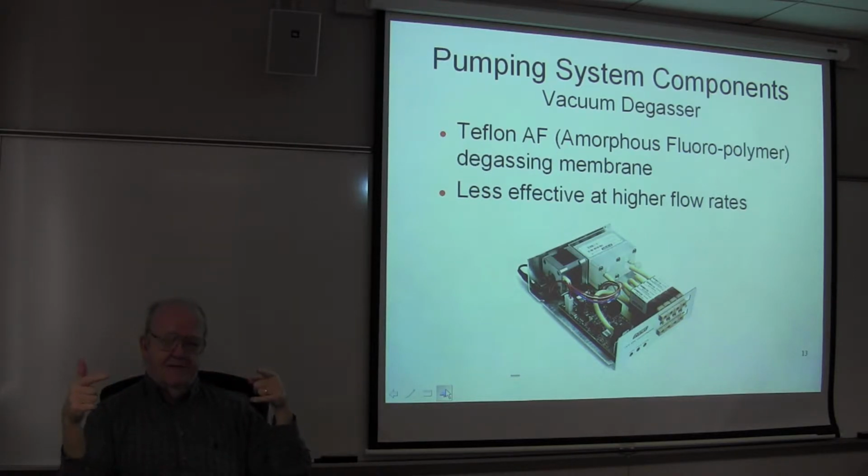Now, so you got a methanol with a lot of gas in it, water, not much gas, but when you mix the water with the methanol, the solubility of the gases in the mixture is now lower, and so they outgas, which means they form bubbles. And the bubbles can hang up in the pumping system.